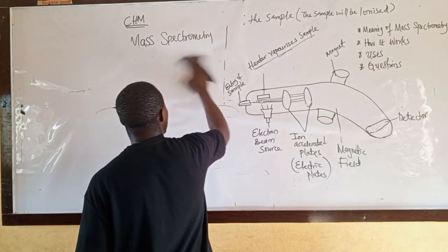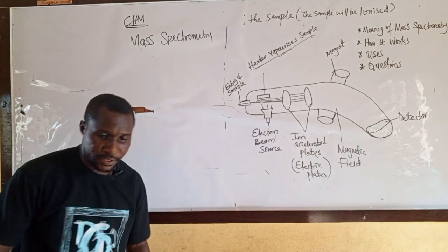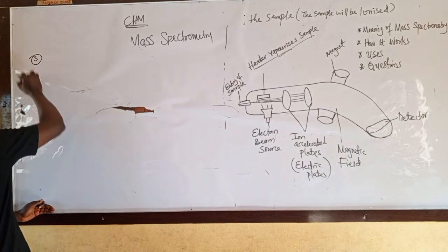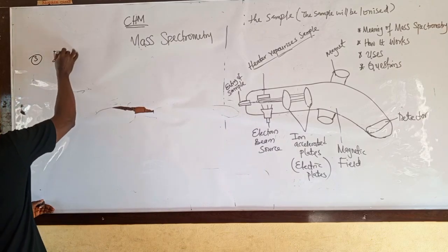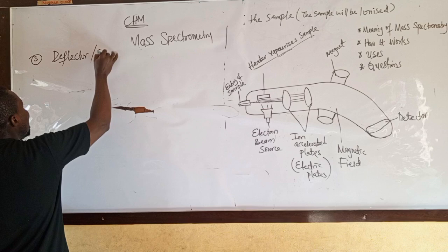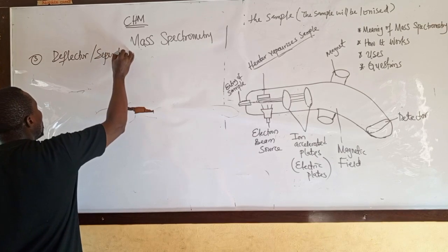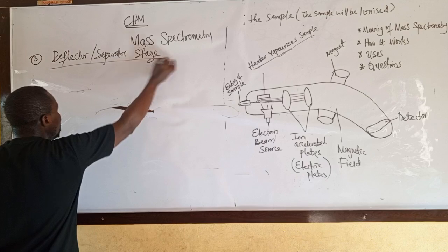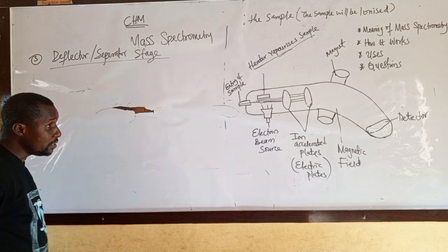Let's move. What is the third stage? Number 3. I call it the deflector stage or separator stage. Very big stage.